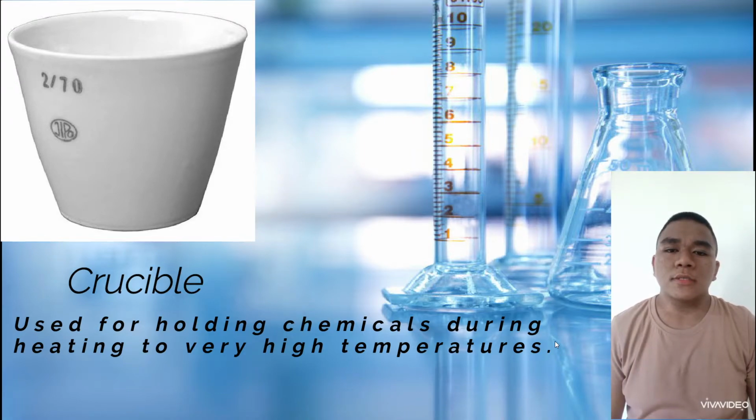A crucible is a ceramic or a metal container for melting and testing metals. Metals that can be tested in crucibles are aluminum, nickel, and copper, etc. Crucibles can also be used in melting cast iron.